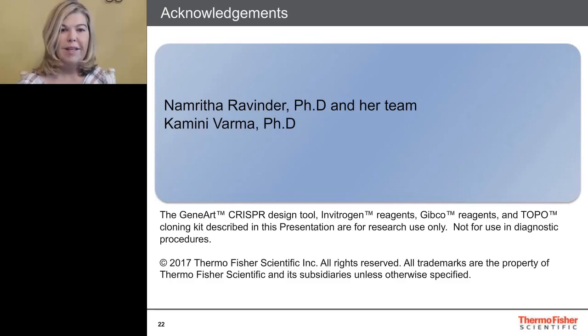Thank you, Dr. Jackson. And we have time for one more question because I want to also provide you an opportunity for final comments today for our audience. Our final question: I have heard about the Seq Studio. Could you share some details about this instrument and the applications you can run?